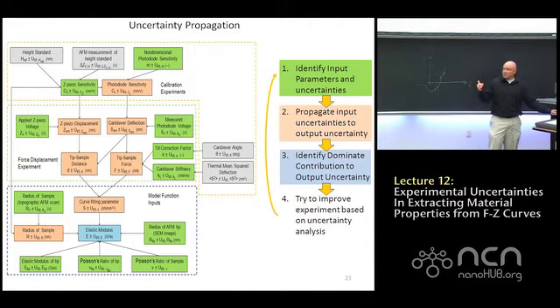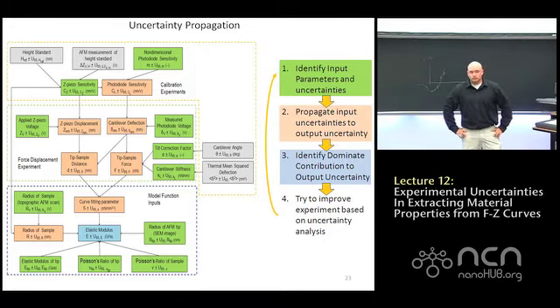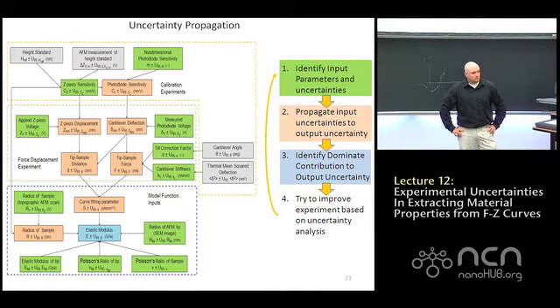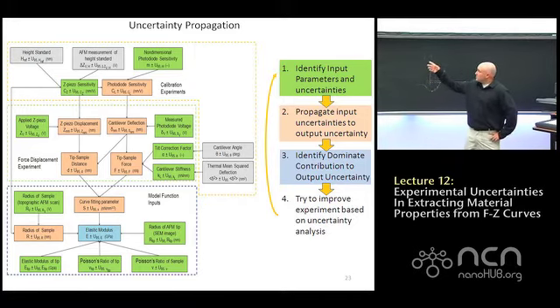Is it clear what I'm saying here? Does this chart make sense to everybody? I think it would be nice to give a brief overview of where the uncertainties are creeping into the modulus measurement. If you can just go over it from this chart, just to give an idea. I kind of got that in some later slides. But yeah, keep in mind this chart, and a couple slides down the road, I'll start telling you what the uncertainties in these input parameters are.